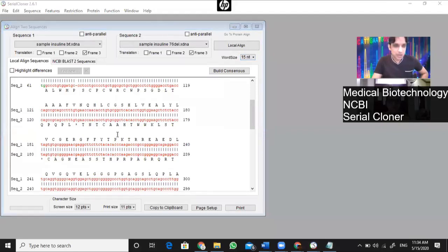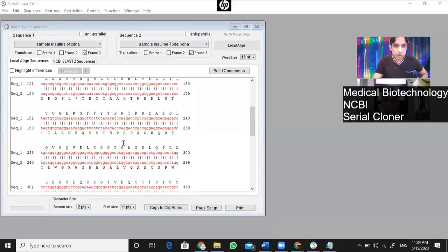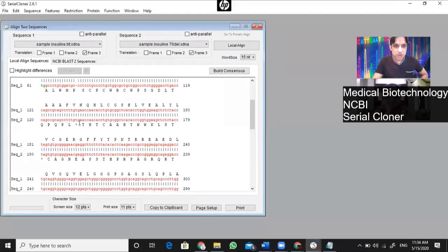Well done. Thank you. So there should be no stop codon in the upper amino acid sequence until the wild type stop codon appears. But because of the shifting of the translational frame, you can see a stop codon here. So no protein translation will be there after that.